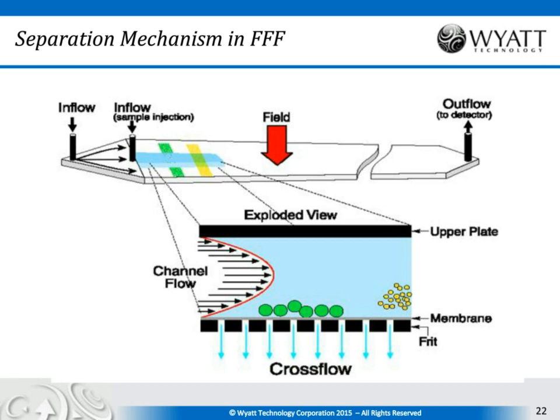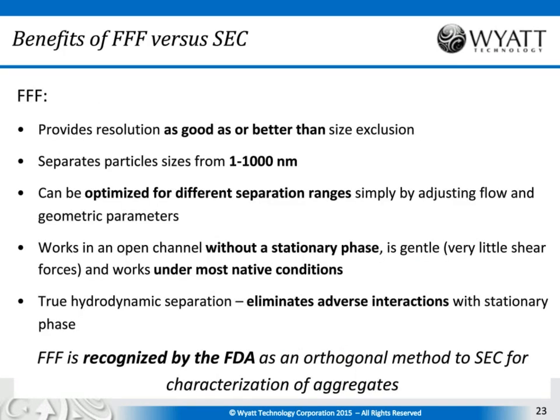So it's a very gentle technique. There's very little shear involved, very little surface interaction, and it has many advantages over standard packed column separations. This technique will give you separation even for macromolecules, which is as good as or better than size exclusion. Very large range for separations.